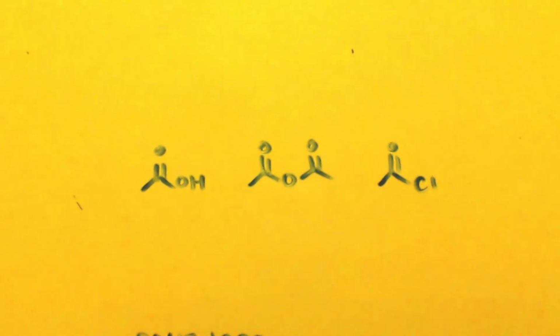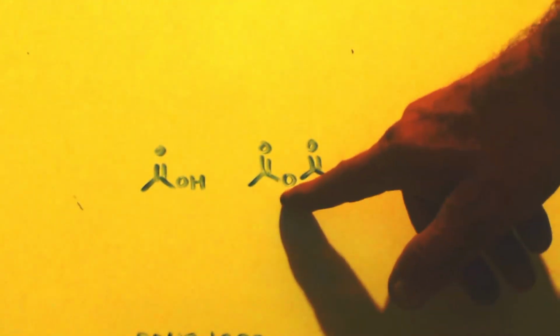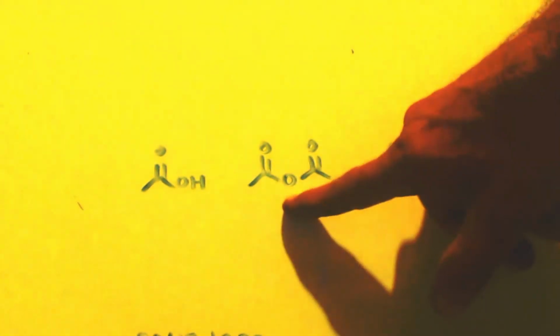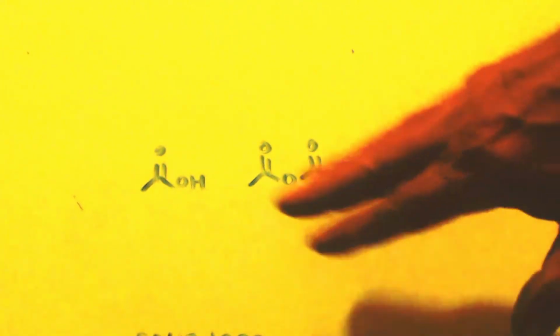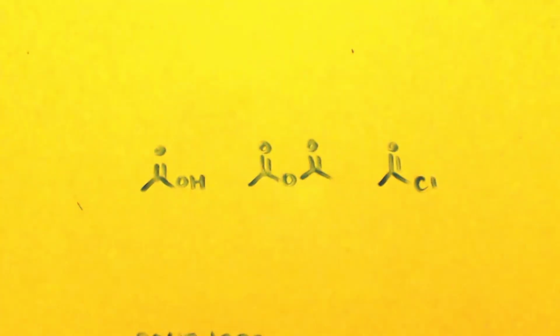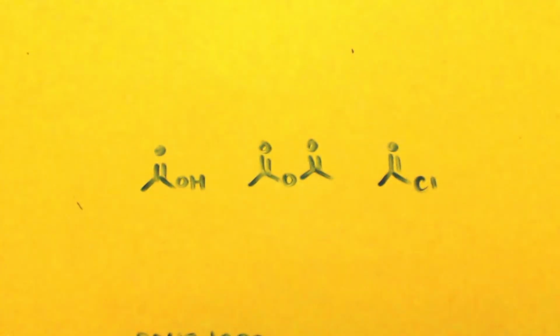But anyways, if you wanted to make the salt dry, instead of the dihydrate salt, you would have to toss some of this in with the glacial acetic acid that you're using as a solvent. Throw some of this, not anhydrous acetic acid, but acetic acid anhydride. And then your Mn3 salt will come out anhydrous. Okay, I just wanted to clear that up. Most people probably understood that I was talking about the anhydride, but I just wanted to make sure.